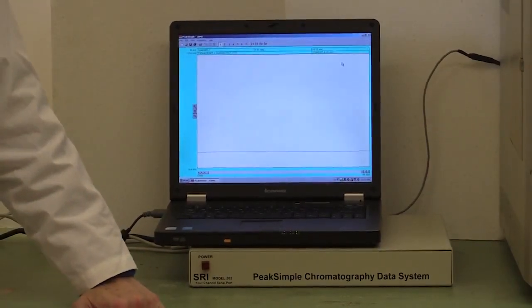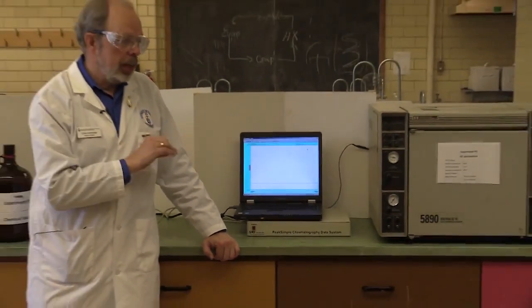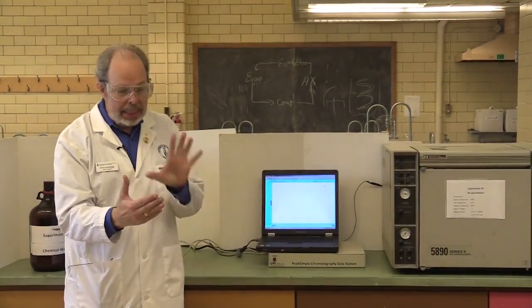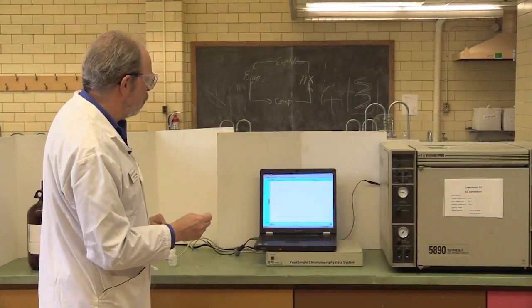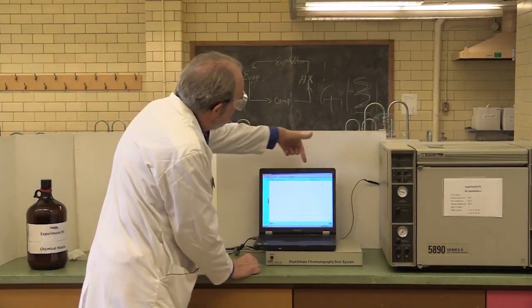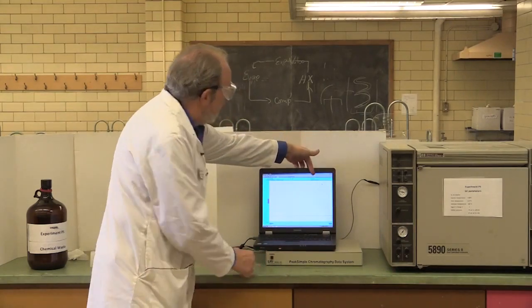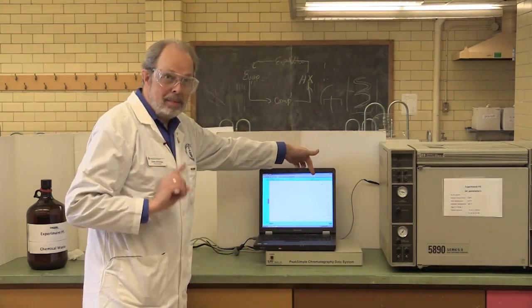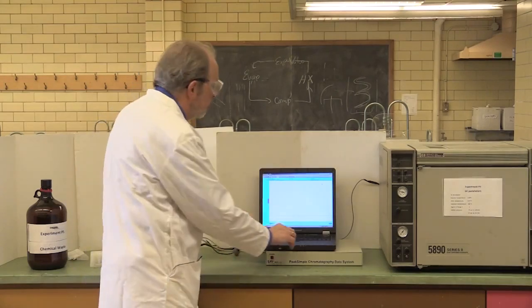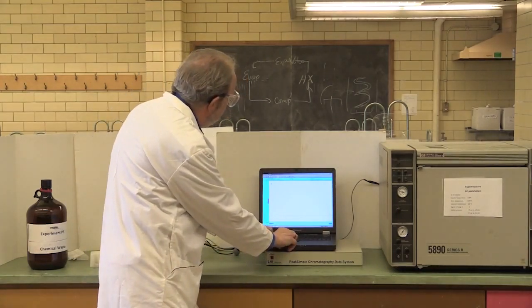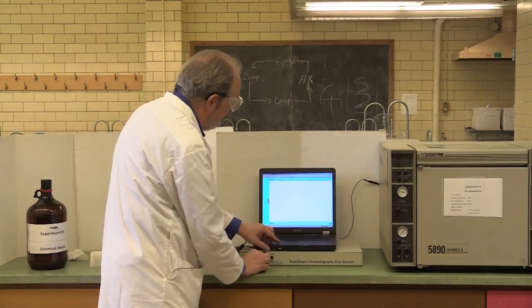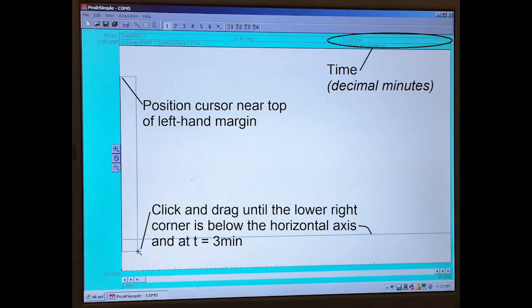Now, the first thing we need to do here is reset the parameters. Unfortunately, the defaults are not what we would like them to be. And you will end up with little tiny gas chromatograms scrunched into one corner of the page if you don't do this first. Up here in the top right is an indication of time. It's in decimal minutes, not minutes and seconds.